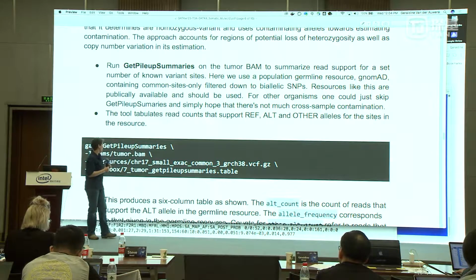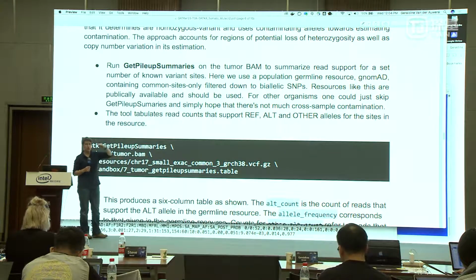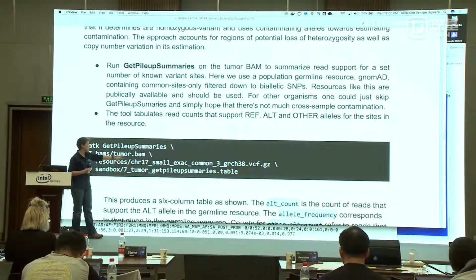We don't want to have to do too much work, just enough to find a satisfactory number of informative sites. And so we're going to look at the subset of sites, and for each of those, we're going to do basically a fast genotyping. Fast on-the-fly genotyping, no reassembly. This is one of those cases where you can do kind of quick and dirty genotyping to get a sense of what is the genotype of the person, and we're looking for germline events actually in this tumor.